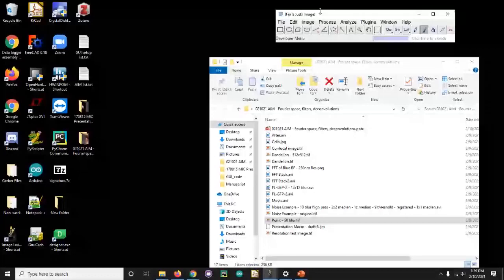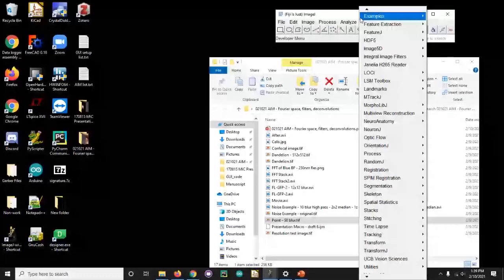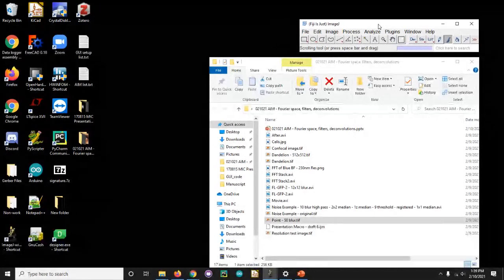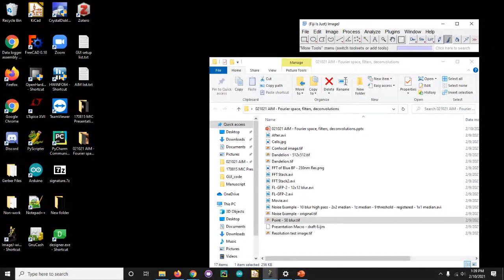So yes, but you wouldn't use the mathematical deconvolution, because to do it based on point spread function, one, point spread functions are three-dimensional, and two, you need to normalize the amplitude of the point spread function to the amplitude of the image. But yeah, there are plugins, but effectively that's all you need, right? You just need the point spread function and the image. Oh, there you go. Someone posted it.